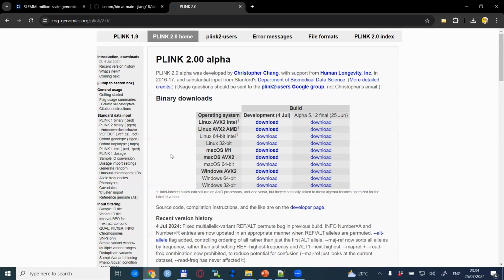Technically speaking, you can also do the Plink preparations in Windows, for example, but it makes little sense to move back and forth from one system to another. So my advice would be to download the Linux versions and do everything in one spot.